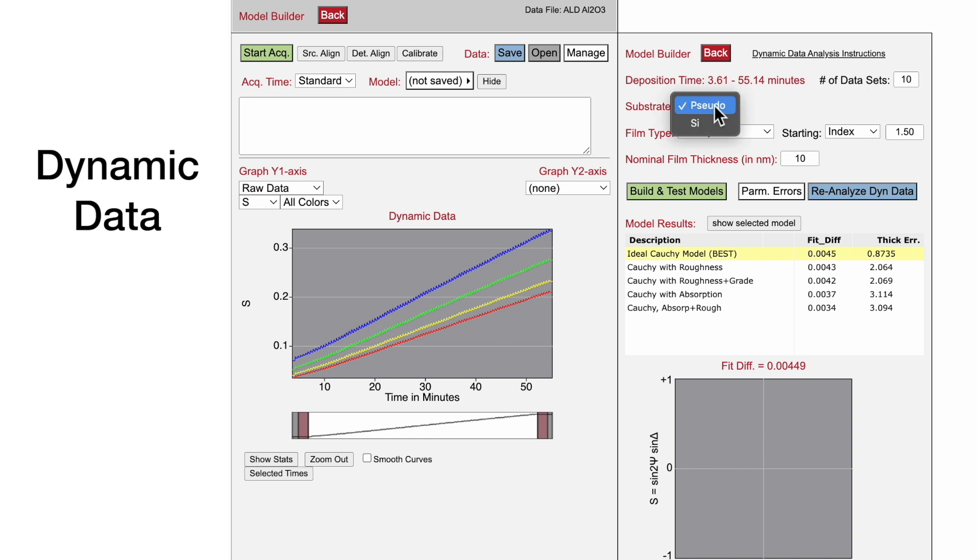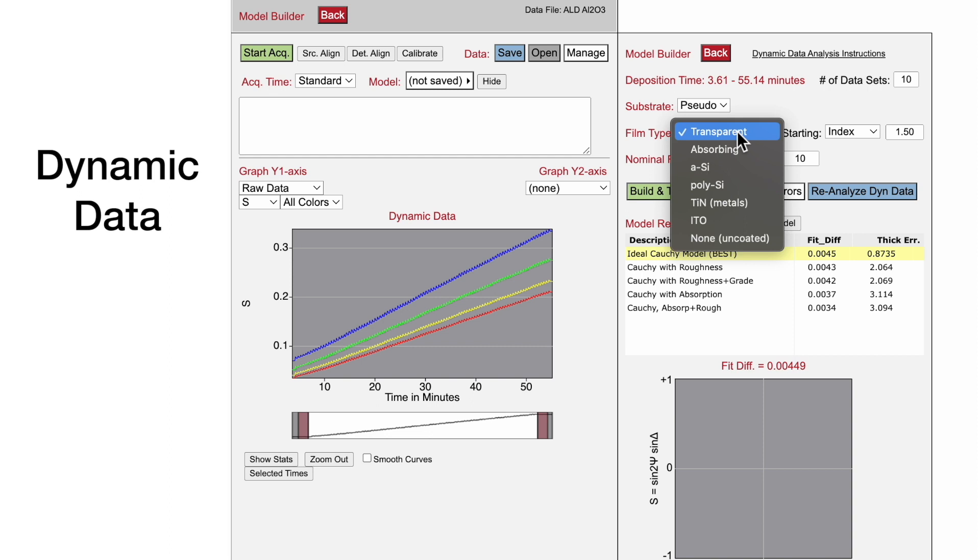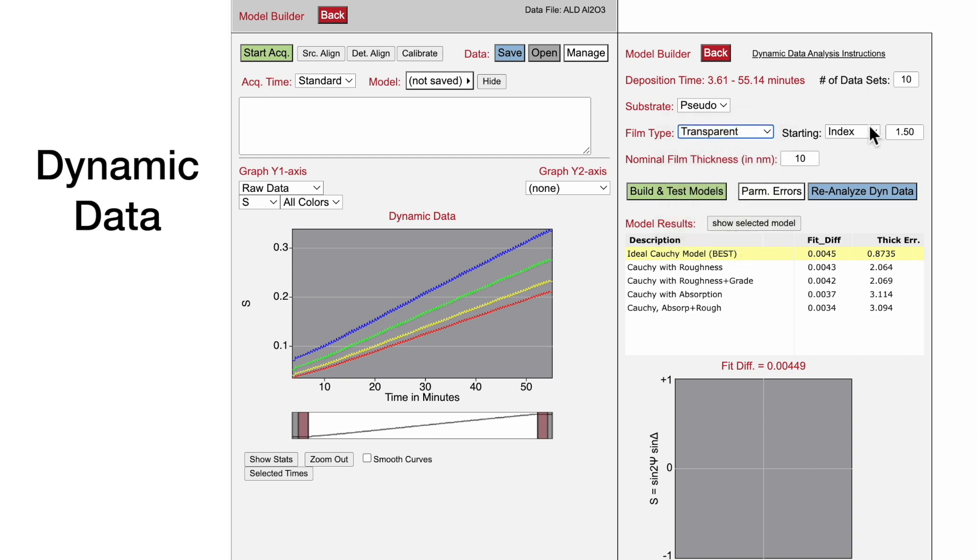Specify the substrate, and pseudo is typically used for in-situ applications. The film type, which is transparent in this case, with a starting index value of 1.6.